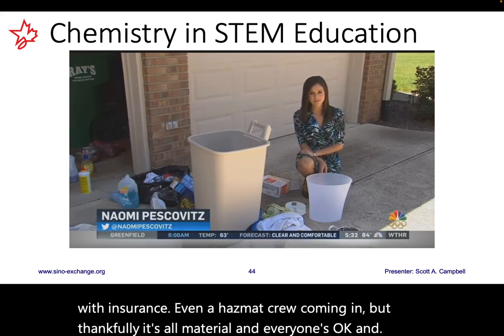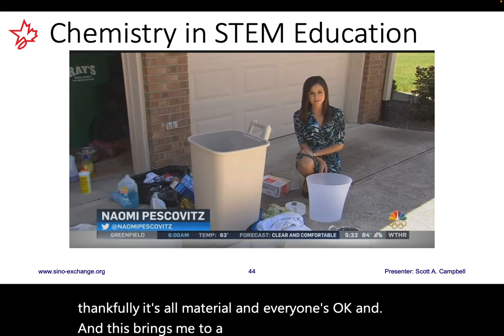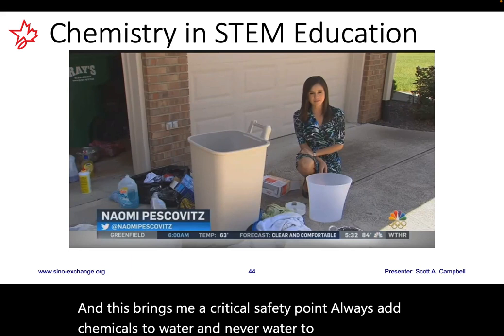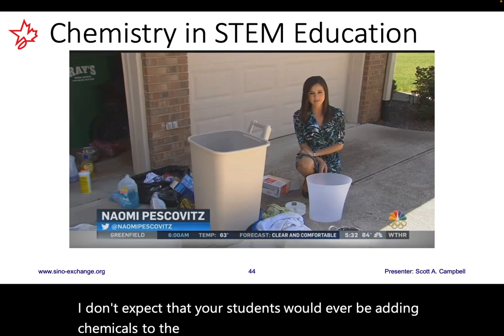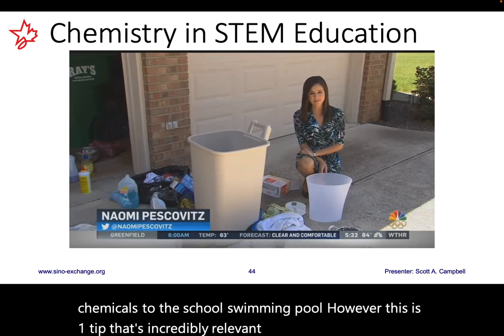And this brings me to a critical safety point. Always add chemicals to water and never water to chemicals. Now, I don't expect that your students would ever be adding chemicals to the school swimming pool. However, this is one tip that's incredibly relevant to any lab experiment.